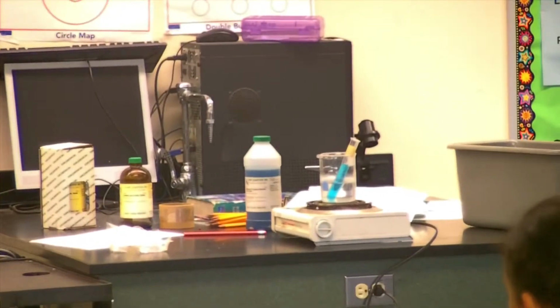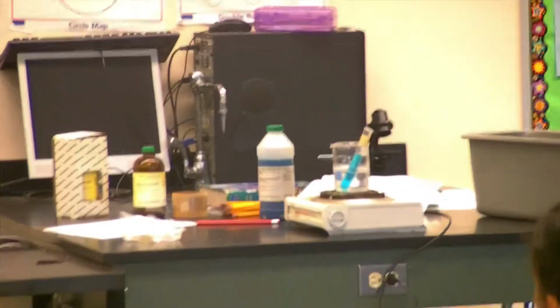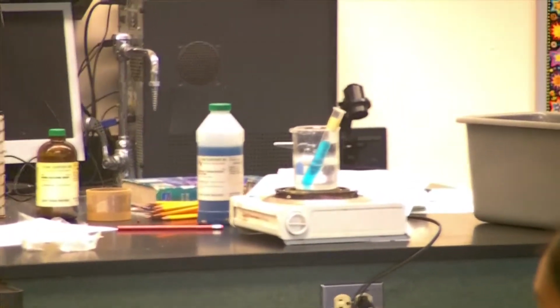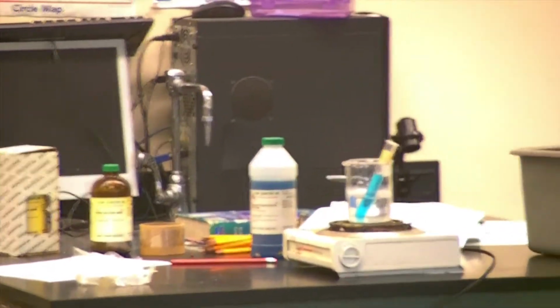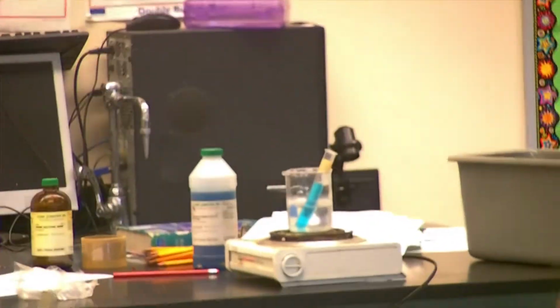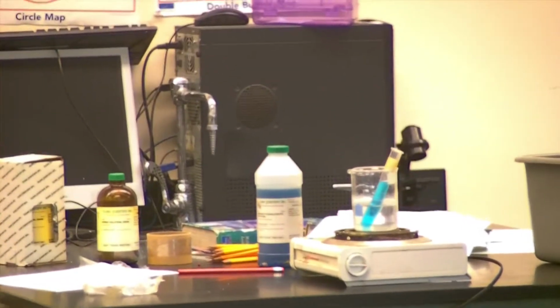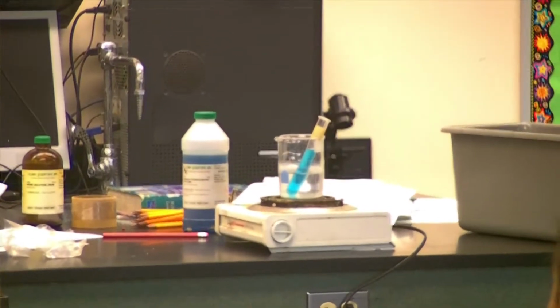Now, what's the purpose of this demo? Check at the top. What's it say? Okay, how some things can go through a membrane and some things can't get out and vice versa. Okay, who's that similar to? What are we talking about here? Cell membrane. Some things come in, some things can go out, some things can't come in, some things can't go out. Okay, so we're gonna let that marinate for a little bit.